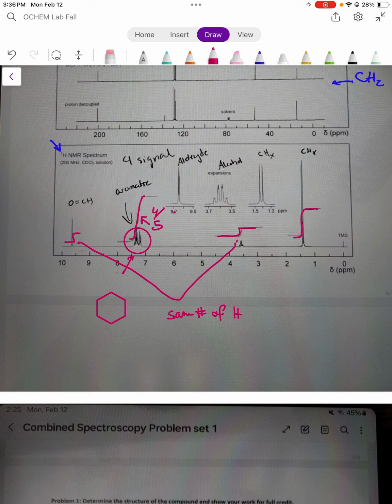for the spectra for things that are p substituted will show up in like 2 very clear doublets, because like this has a signal and this has a signal. That's not the case here, so we know it's only mono substituted. So this is what we're learning at each stage. We know that we have something that looks like this, and we know that it can't look like this. It would have to be like that.